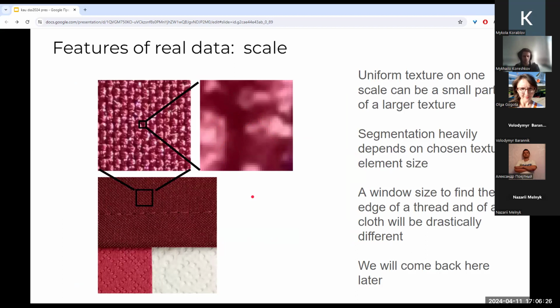For example, many biological image formats always store real-life distance information with the image. Apart from the number of pixels, the width and the height of your image, biological images also store the scale, to make sure that we understand this scale thing properly.